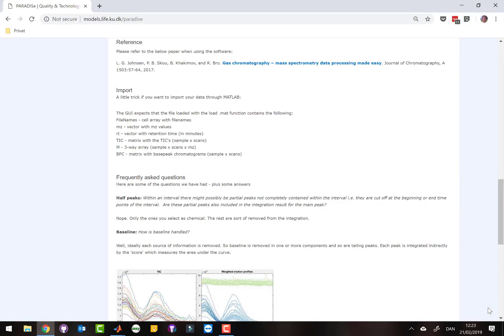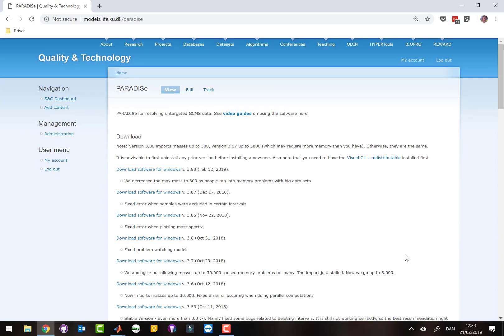You can find it on our website models.life.ku.dk/paradise. Notice that there are two versions: version 388, which will only import masses up to 300, or version 387, which will import masses up to 3000. However, that might lead to memory problems sometimes, so if you don't need it we suggest you use version 388.